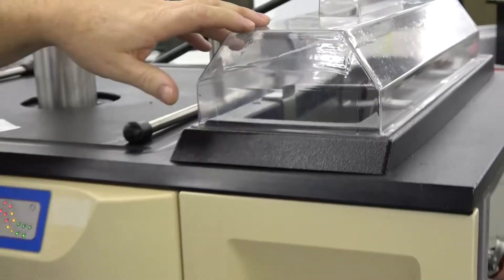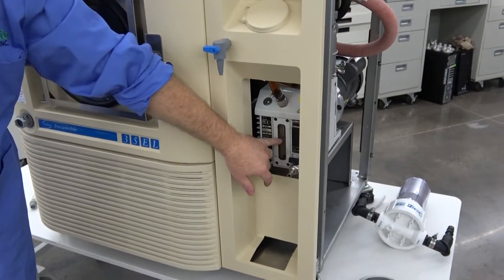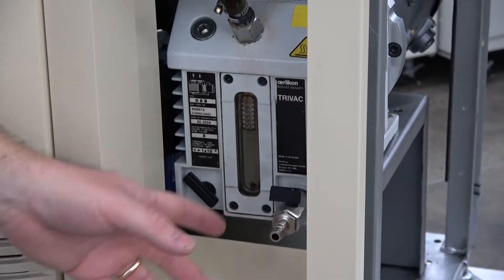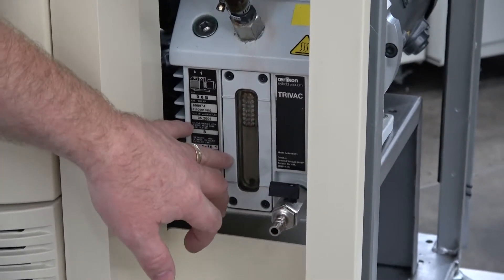Just a really nice machine after we went through and did a few things to it. Down here you're going to see the vacuum pump, and you can see we did a flush and replaced the oil in the vacuum pump. I like the way they designed this because you can do a really quick vacuum pump oil change, and that's something that's really important when you're doing a lot of evacuation — you get some contaminants in the oil.